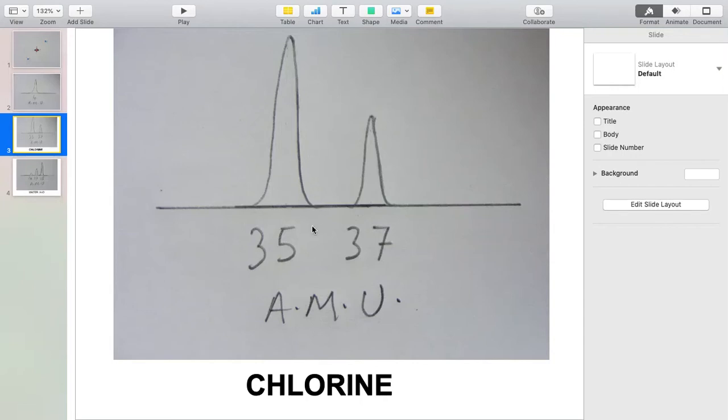So the figure you see in the periodic table is 35.5, I think 35.45. So an important thing to understand is that the masses given in the periodic table are different to the exact masses that you would measure with a mass spectrometer. The masses in the periodic table are the average of the normally occurring isotopes.